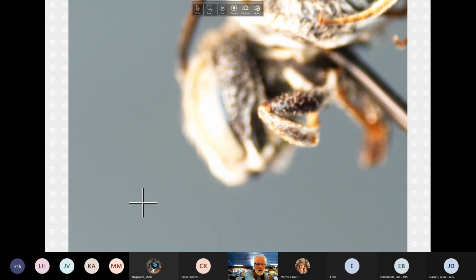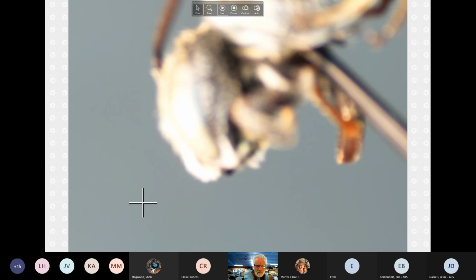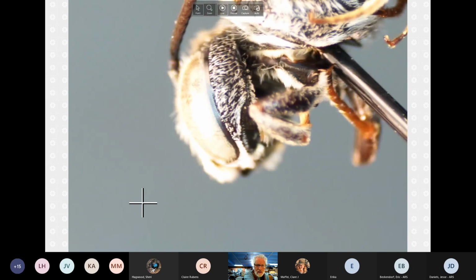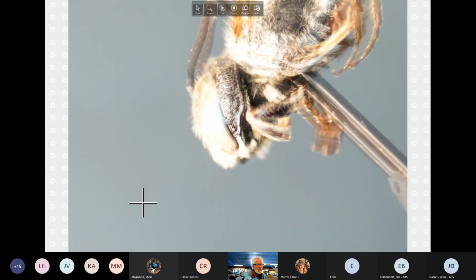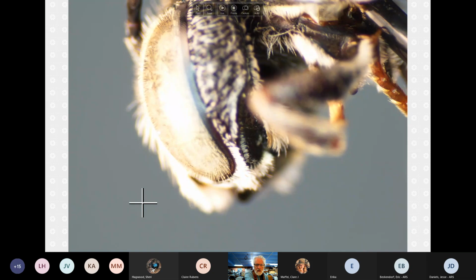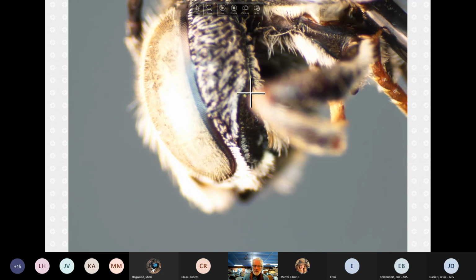Okay, we have a leg partially in the way, but okay, it is at the top. I was confusing the bottom hairs that were just the edge of the thing. So, bottom of head, that's a leg in the way. Here's this large hollowed out area, fovea, if you will, I guess. And here's a strip of hairs, and that's all that's in there. Everything else is bare. So that's indicative of a set of species.